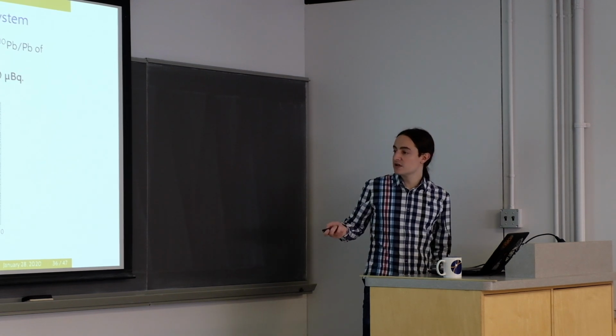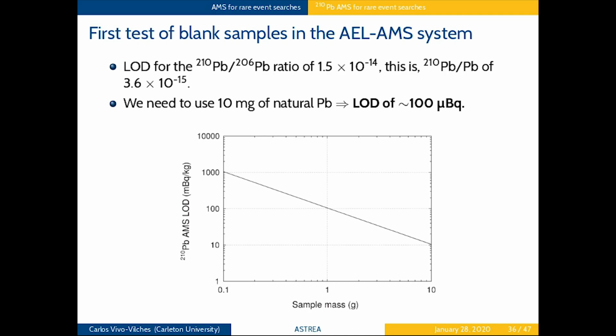Maybe for some samples, here you can say the sample mass that we could use, and how that is related to the limit of detection for lead-210.